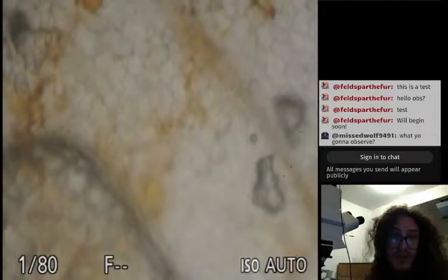You have like some really weird areas where it's more watery and others where it's more pink. I wonder if that's damage to the leaf, or just the leaf being weird. Like, hold on, here is a more transparent area.